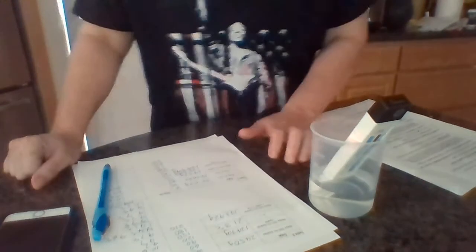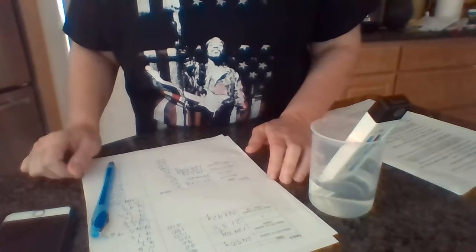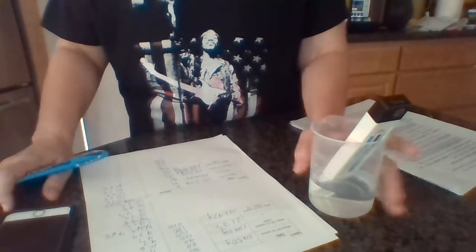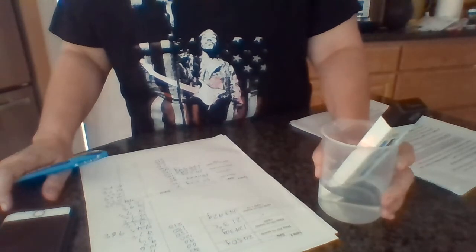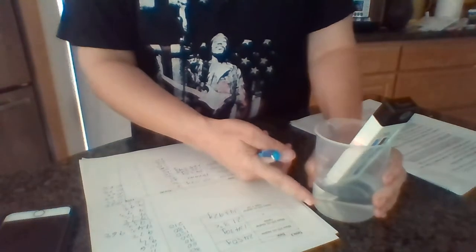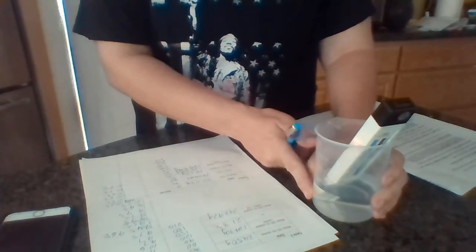This is experiment 6, calorimetry, part C. We're going to determine the specific heat of the metal, and this is the procedure portion. Again, I have already gotten the mass of my beaker, and I have placed approximately 100 mL of water in there. I got the mass of the beaker and the water.